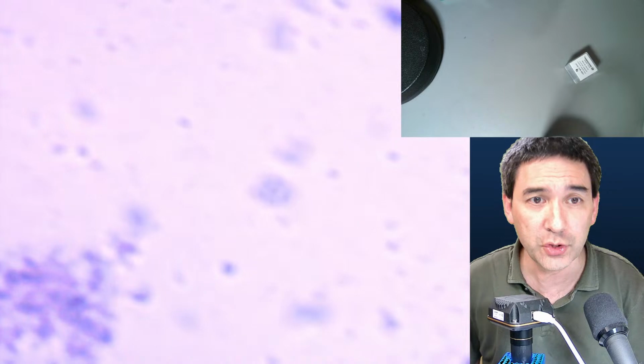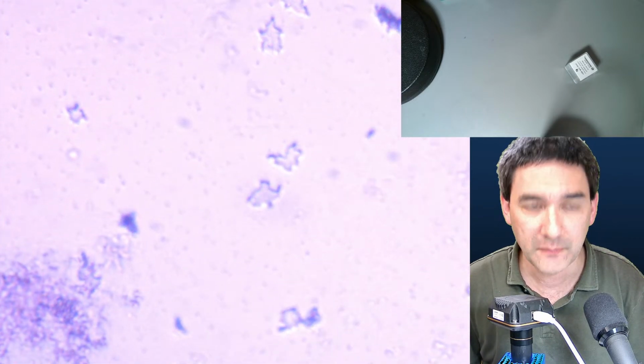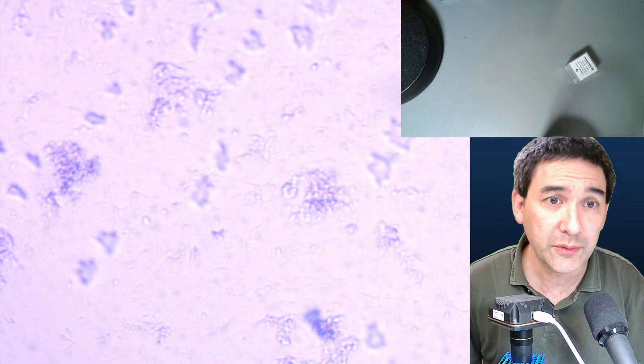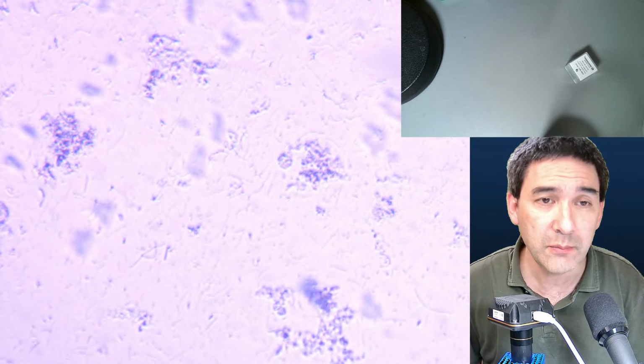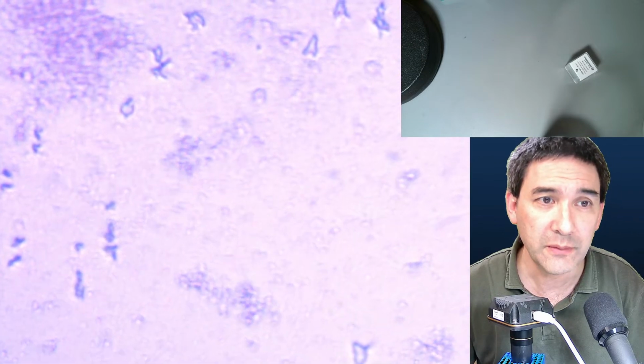But maybe that's still a good example, because it shows the limitations of everything. There's lots of stuff floating around, but I don't see any movement. Where are they? Maybe I got it from an unfortunate place. There's lots of debris. Today in the afternoon I got it much better.